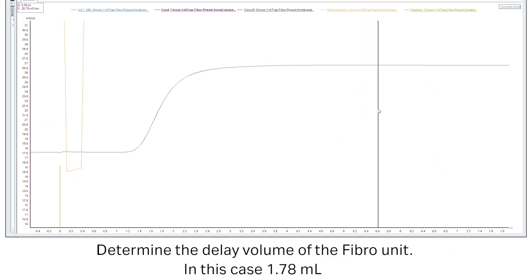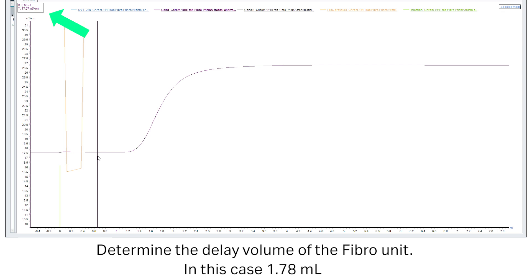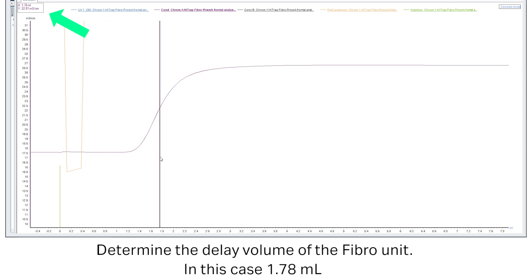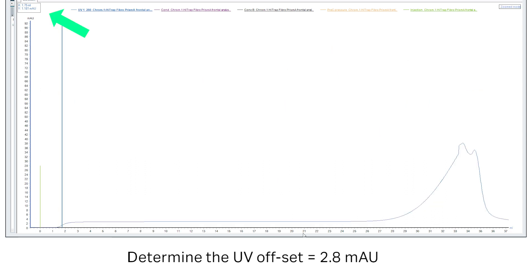Determine the delay volume of the Fibro Prisma unit at 50% increase in conductivity. Determine the UV offset from the plateau before the breakthrough.